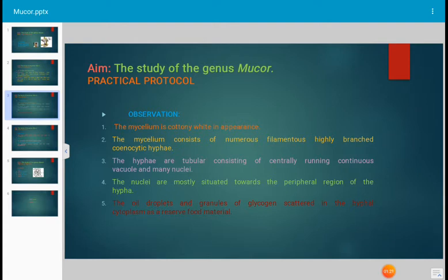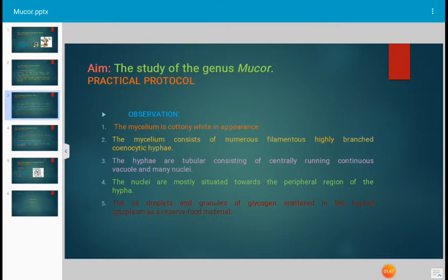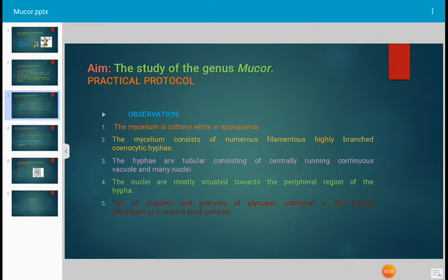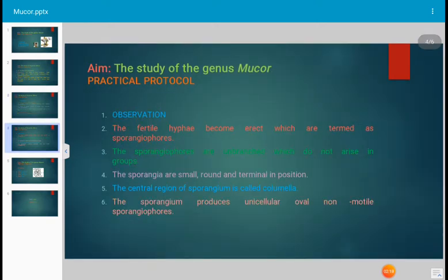Observe the slide under the microscope keenly and write down the details. The mycelium is cottony white in appearance and consists of numerous filamentous, highly branched, coenocytic hyphae. The hyphae are tubular, consisting of a centrally running continuous vacuole and many nuclei. The nuclei are freely suspended in the cytoplasm, with most nuclei gathered toward the peripheral region of the hyphae. The hyphae also contain oil droplets and granules of glycogen scattered in the hyphal cytoplasm, which serve as reserve food material.